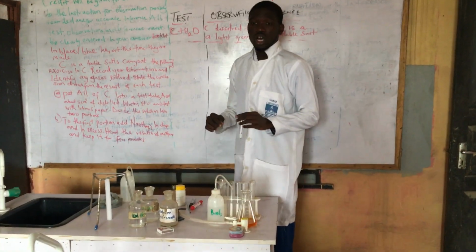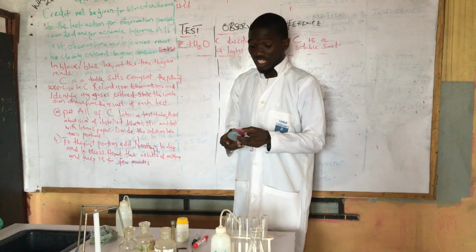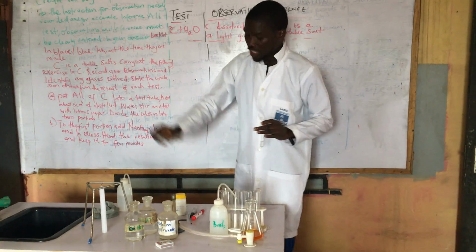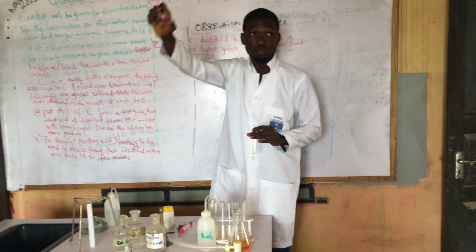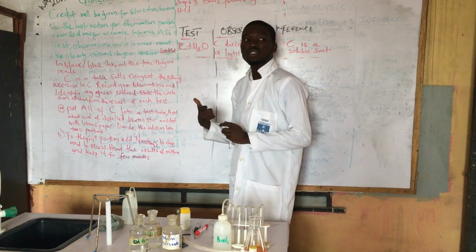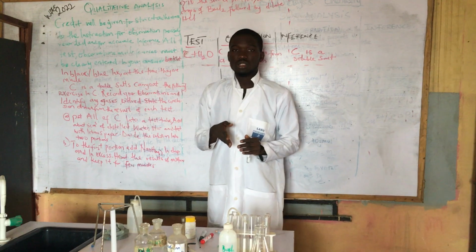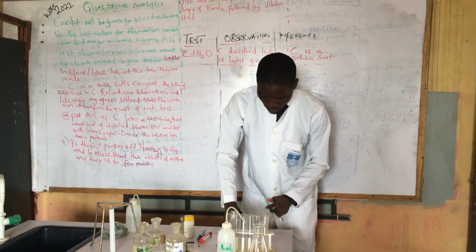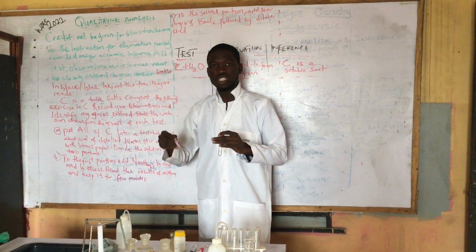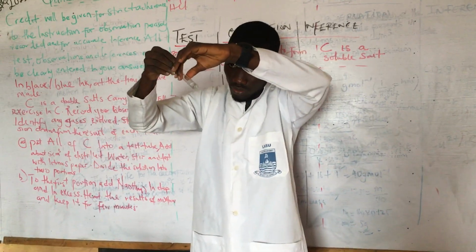It has also been stated, among the guide given to teachers, that you have litmus paper here. This is our red litmus paper, and this is our blue litmus paper. When it comes to an acidic or basic medium, you have to check with either the red or the blue. So now class, let's check with the blue and see if there is any effect on sample C plus water plus our litmus paper. Let's check, just a little.